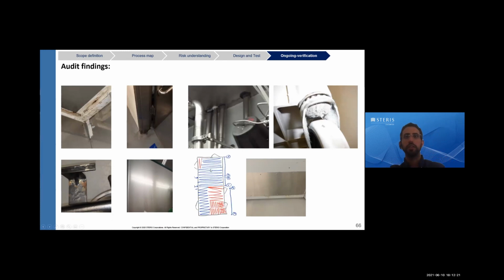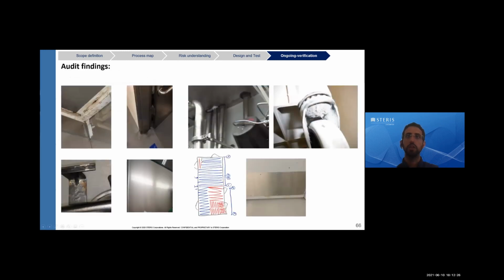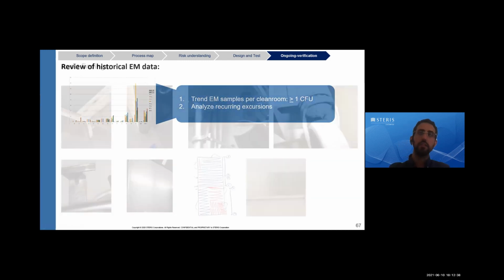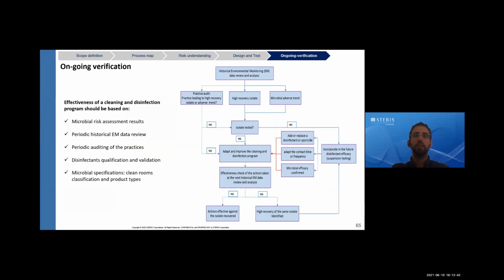Here, it's a case study. I didn't present it, but it's a case study where it shows that, in that case, from 1 to 3, the wet contact time validated was 10 minutes, but the real wet contact time was 2 minutes, for example. So all those types of practice will affect your cleaning and your EM data, potentially giving pop-ups or excursions in your EM data.